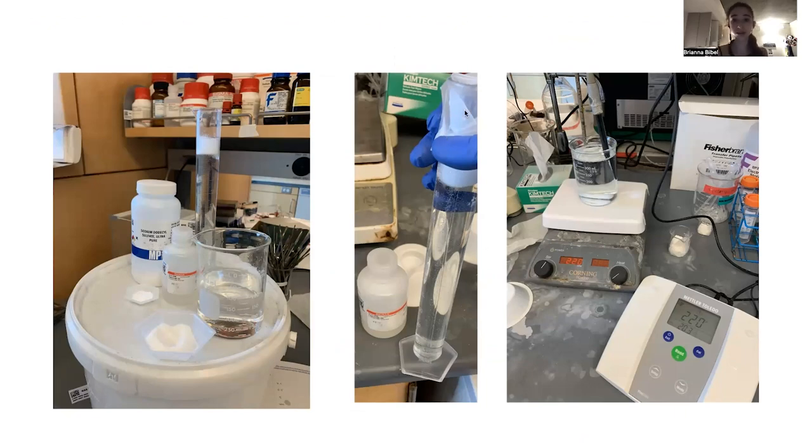It's easier when you're shaking it like this, and then you can add it to the rest of your solution without trying to get it to dissolve when it's all gunky and sticks to the bottom of the tube. It's easier to invert it to mix. Speaking of mixing, the glycine is a powder, the SDS is a powder, and the Tween is this viscous stuff. Both the SDS and the Tween are detergents, so they're going to get all bubbly. You want to avoid foaming and bubbles as much as possible, and definitely when you're trying to see if your solid is dissolved.